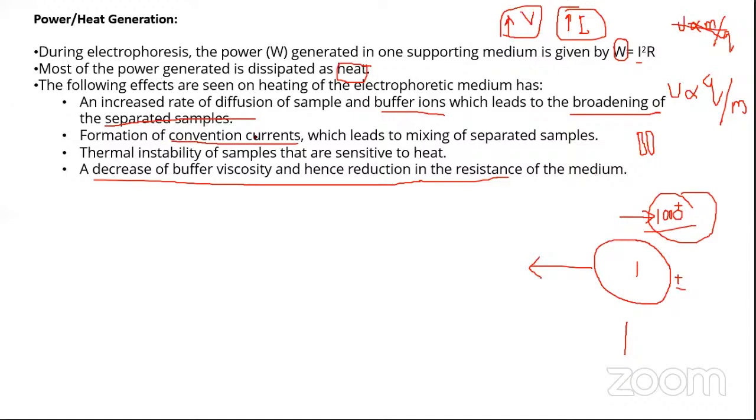So how will you do it? You can do it by minimizing the heat production now. You increase the current, you expect that there will be more heat. But what if I put up a cooling system here? Can I do that? Yes.